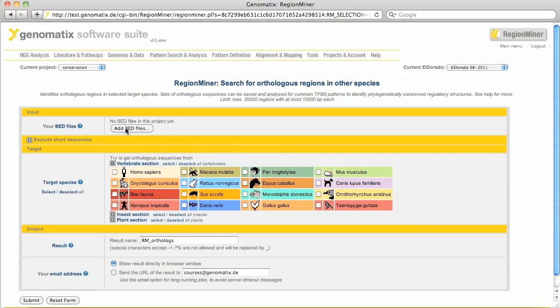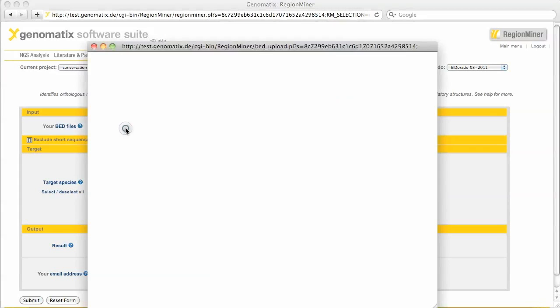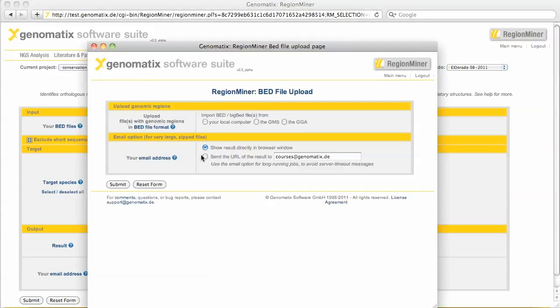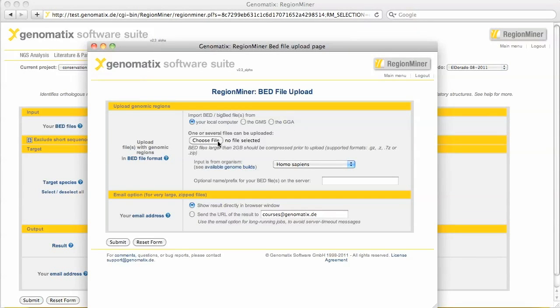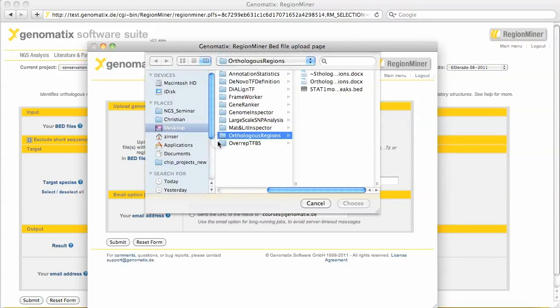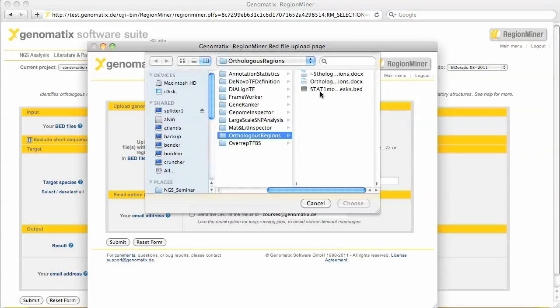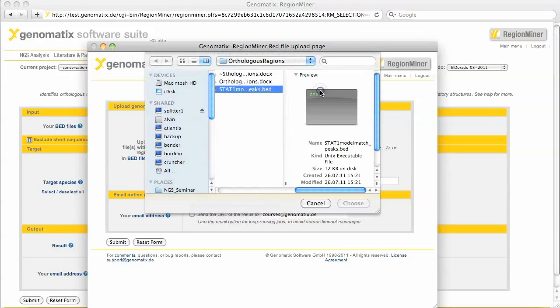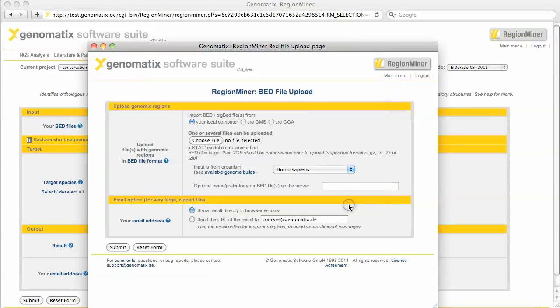As input we will use a BED file with the genomic positions of STAT1 binding regions in interferon gamma-stimulated HeLa cells. This is a subset of the original set of regions, which was selected based on the presence of a specific predominant pattern of STAT binding sites.